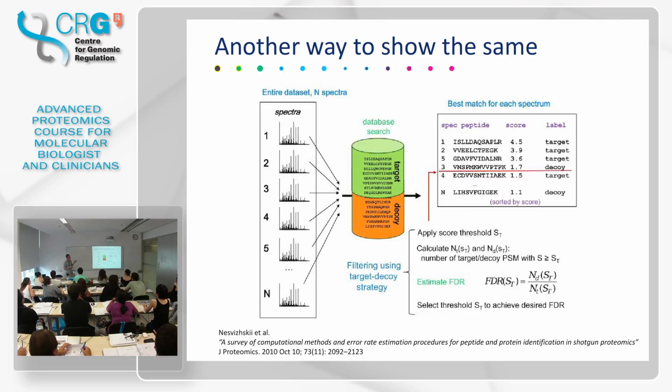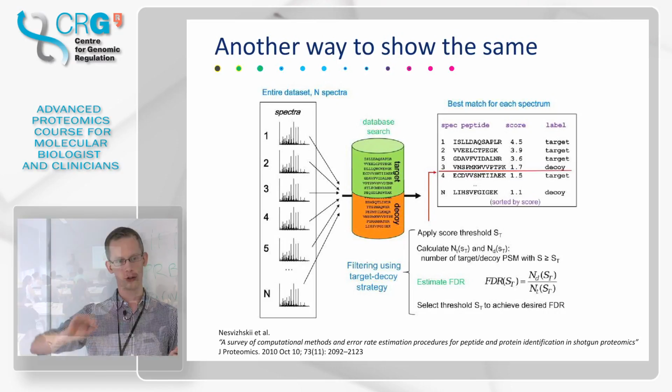Yes, so normally you have thousands of, because we have millions of spectra, right? And this means you also have thousands of identifications. And then we accept that 1% is false. Okay? 1% of the true hits. The decoys in the ranks? Yes, so we remove those. The decoys we know are wrong. So those we can discard.